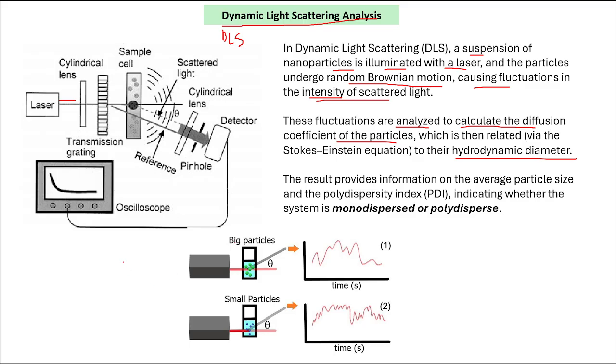So what is hydrodynamic diameter? Suppose this is your particle, and based on electron microscopy you figure out that this is the diameter. Now, what is the hydrodynamic diameter? Whenever you put this nanoparticle in dispersion, suppose in DI water, the electrical double layer that we were discussing will be formed. And now there would be a slight increase in their diameter. So this one is the hydrodynamic diameter. I hope it's clear to all of you.